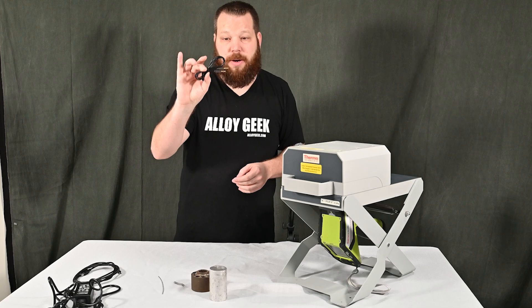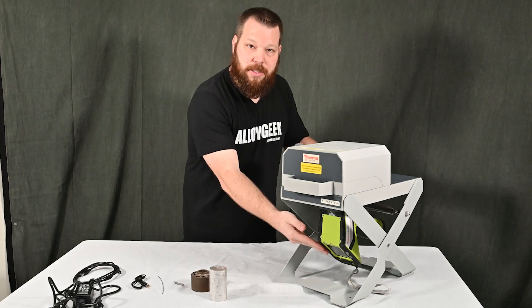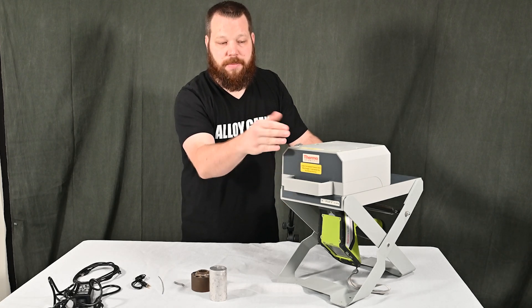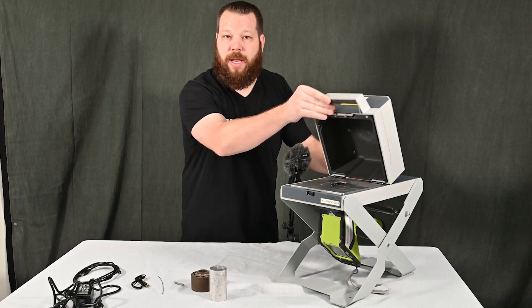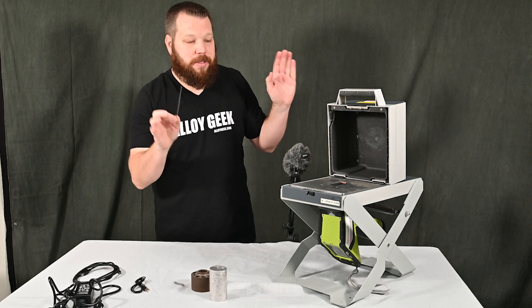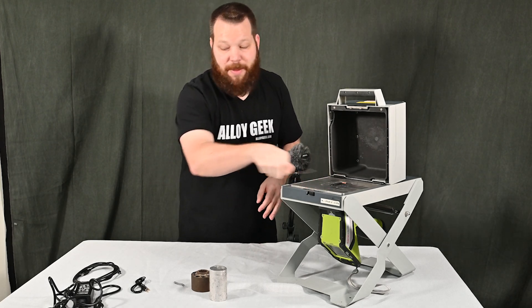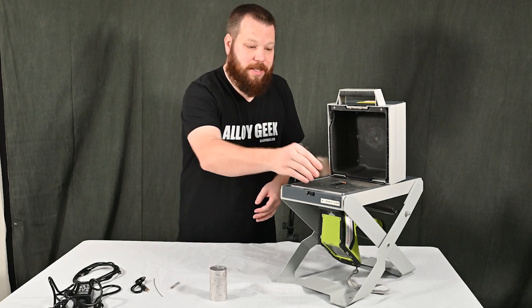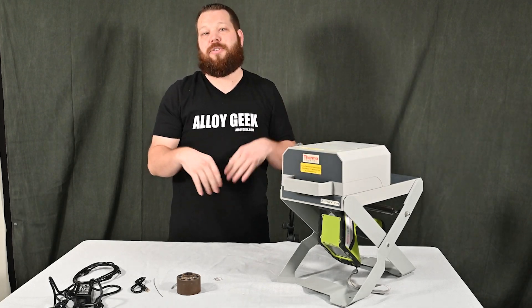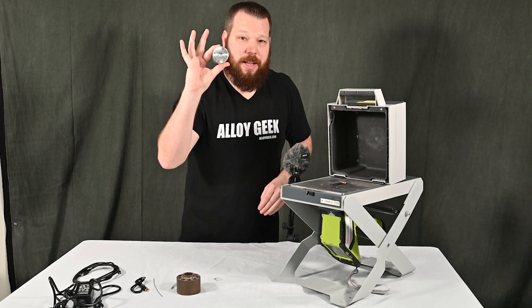In the back of these desktop test stands there are additional ports. This jumper cable — it looks like a headphone-to-headphone male-to-male connection — connects between the Niton and the test stand. That controls the RFID application to know when the test stand is actually closed, and if you open it, the RFID technology automatically turns the x-rays off to keep employees safe. Here's an example where that six-inch piece of weld wire that wouldn't fit in the mobile test stand fits perfectly in this one — look at this big sample area to work with.